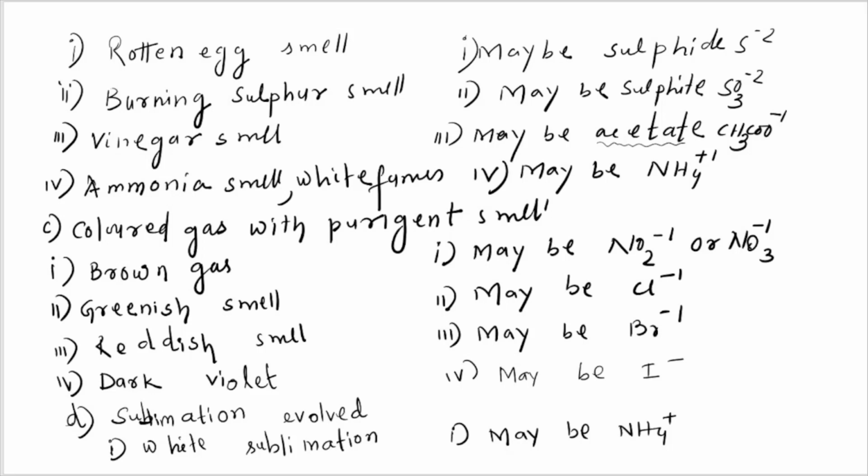Ammonia smell, which one will give ammonia smell? That means ammonium salt. Ammonium salt will give ammonia smell.